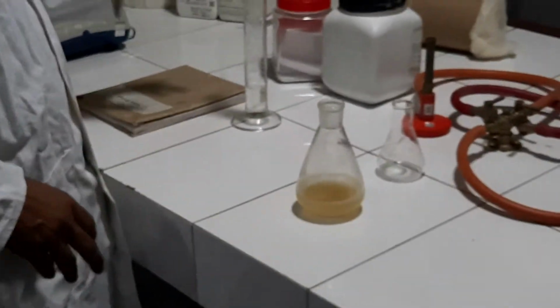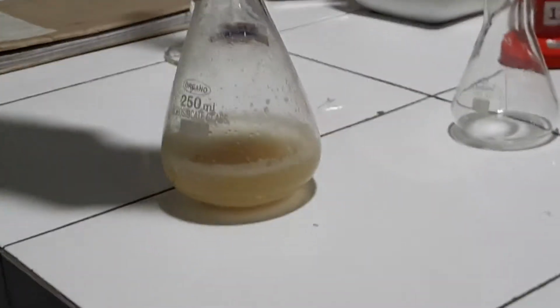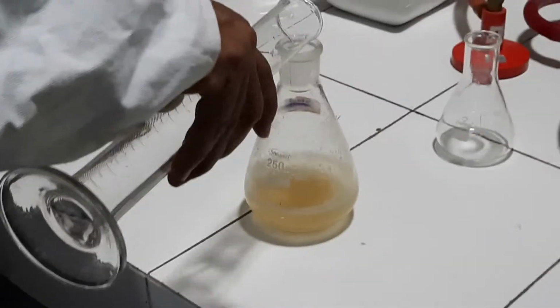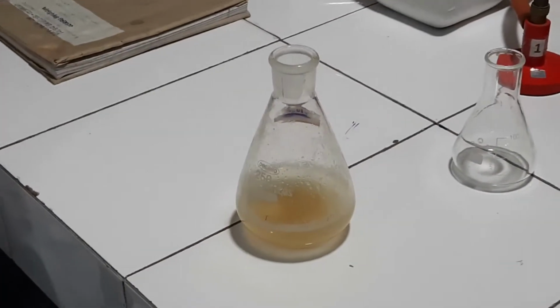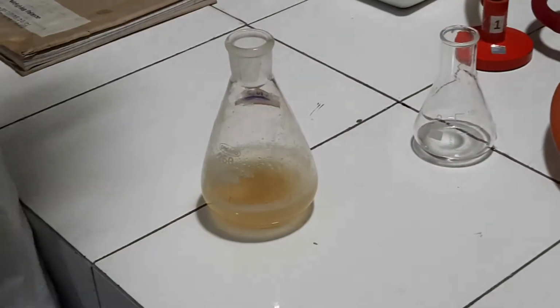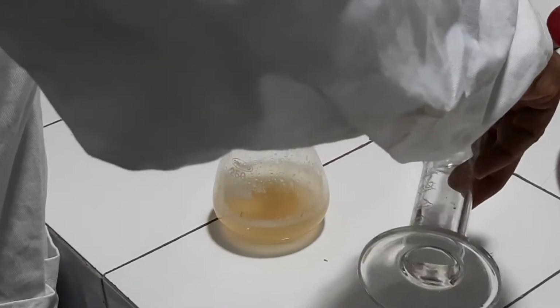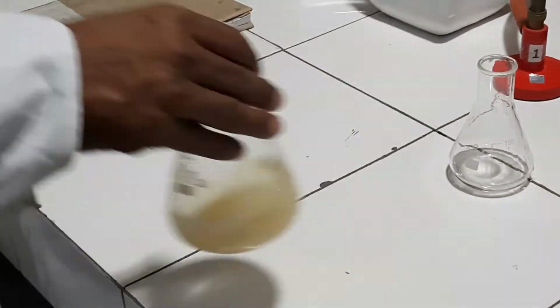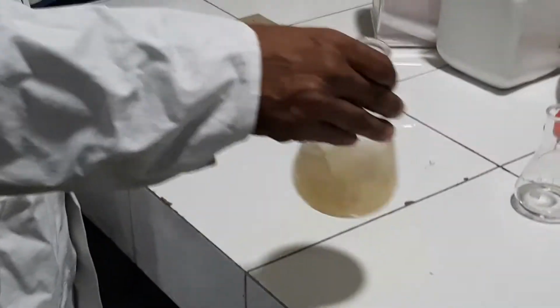solid media volume makeup. This is the 100 ml mark, right? Look, this is the 100 ml mark. Was it not 90? 90. No. This is solid media. Now we will cotton plug it.